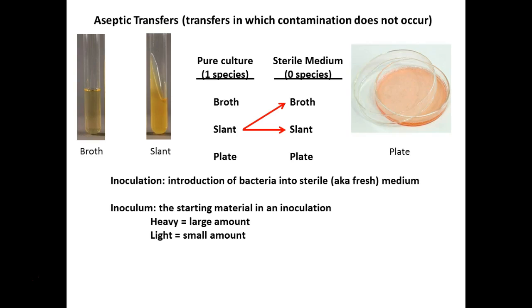So you'll notice even on your checklist today, which is the checklist we use to grade you on the midterm, on the back of today's handout, it says the student chose a straight loop or straightened a bent loop. And you want to do this before you start working with your instrument when it's not hot, right? I'm famous for touching hot things and burning myself. So you want it nice and straight, so that you can utilize the instrument properly.